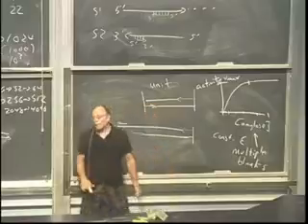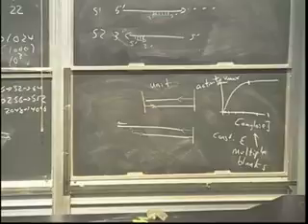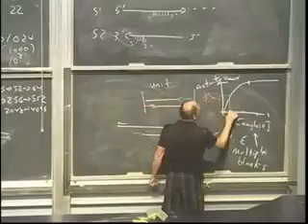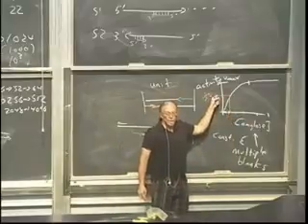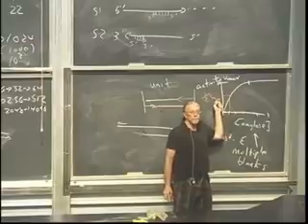And it would be ideal if we did multiple blanks for the temperature experiment, but just there isn't enough time, okay? So the prediction for this is we should see some sort of graph like this. And in fact, there's this value called the Km, which is 1/2 Vmax. It's the substrate at which you reach 1/2 Vmax, okay? That's the Km. And different isoenzymes, salivary versus pancreatic, would have different Kms most likely, okay? All right? So is that clear?